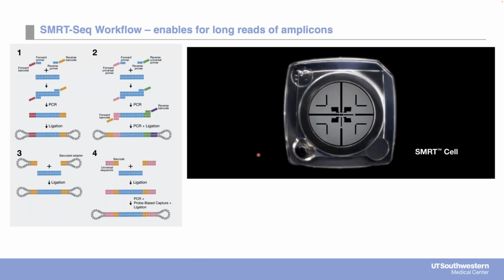And so just to give a brief introduction or background for SMRT sequencing, as you probably all well know now, it is single molecule real-time sequencing. What we've basically done is we take our amplicons of cap genes that are derived from tissues injected with our library. We anneal these SMRTbell adapters, and then these libraries of our SMRTbell amplicons are applied to the SMRT Cell.